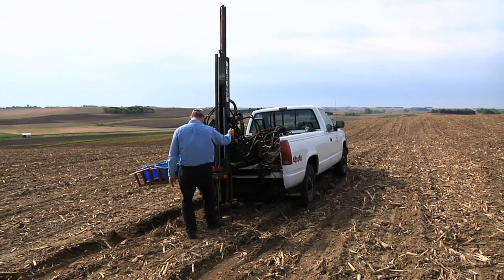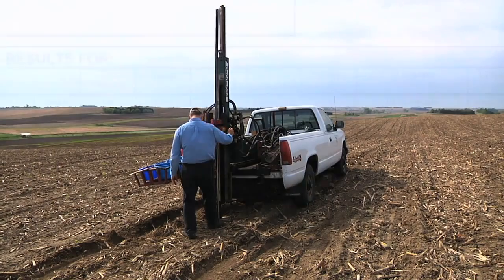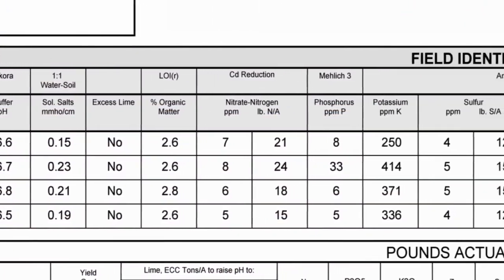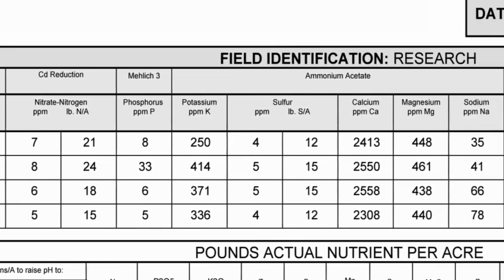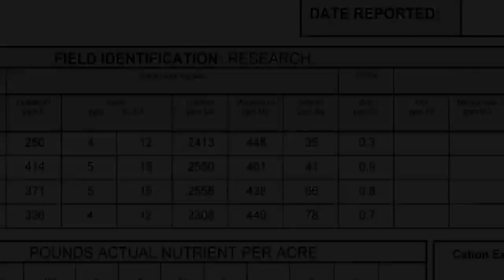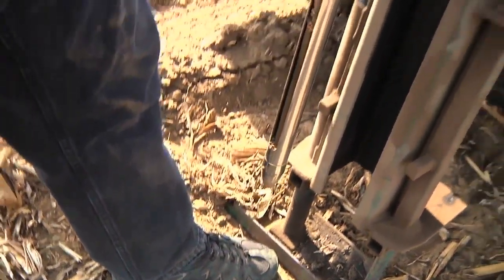Surface samples are used to determine soil pH, lime need, organic matter, phosphorus, potassium, sulfur, and zinc. In Nebraska, soil test correlation and calibration for these tests are based on surface samples collected from 0 to 8 inches. Be sure to sample the entire 0 to 8 inch layer for general fertility analysis.